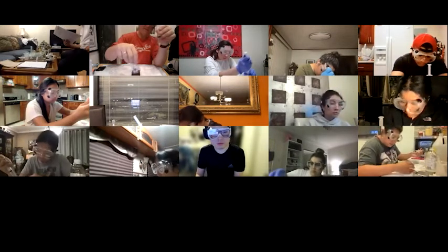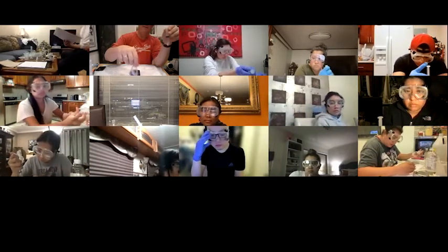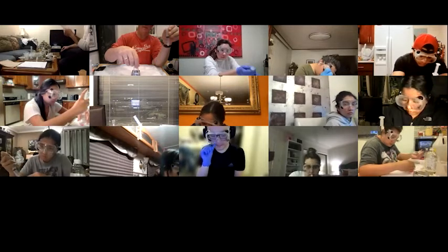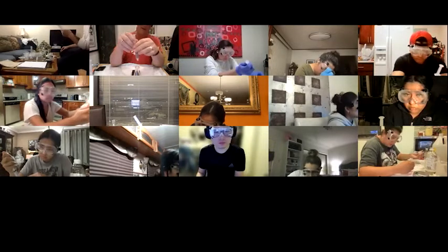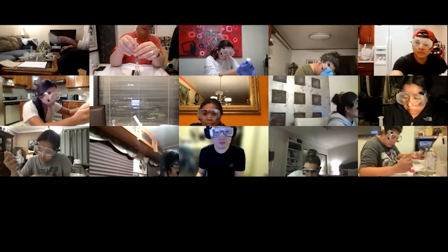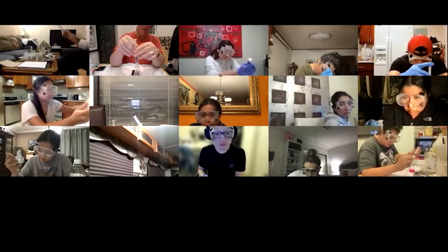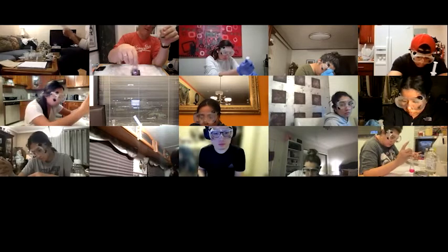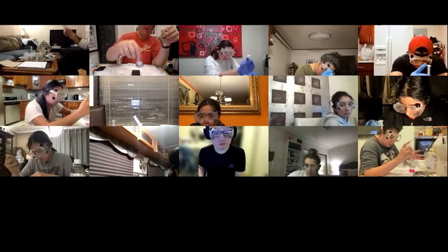So mine did what you said it would, because it was doing drop by drop, and then all of a sudden it was one drop, and then boom, color. Yeah, but it's dark though is the thing. How many drops of indicator did you use? Just one. I've been pressing one time, letting it drop, swirl.